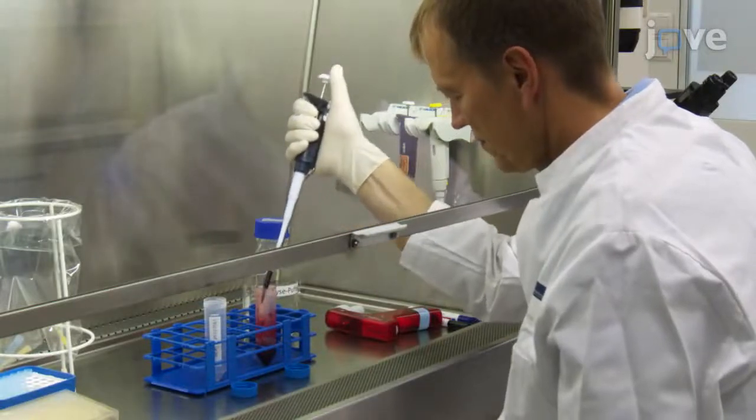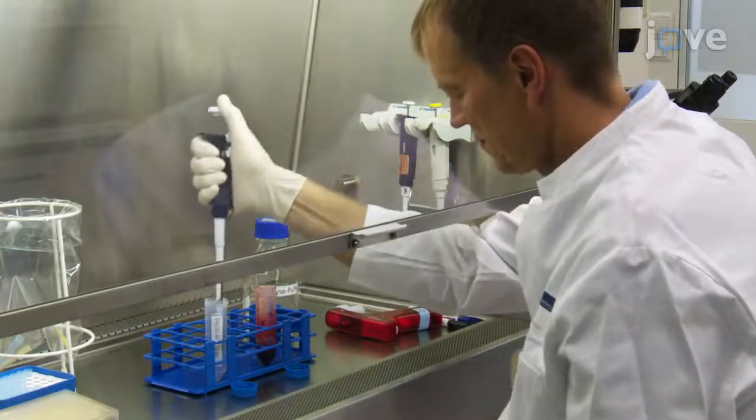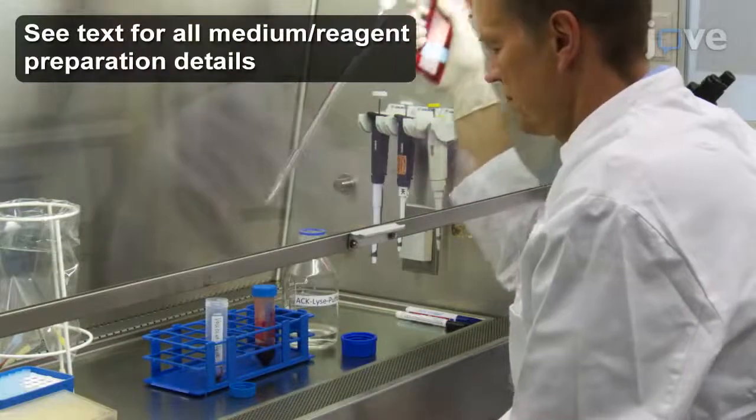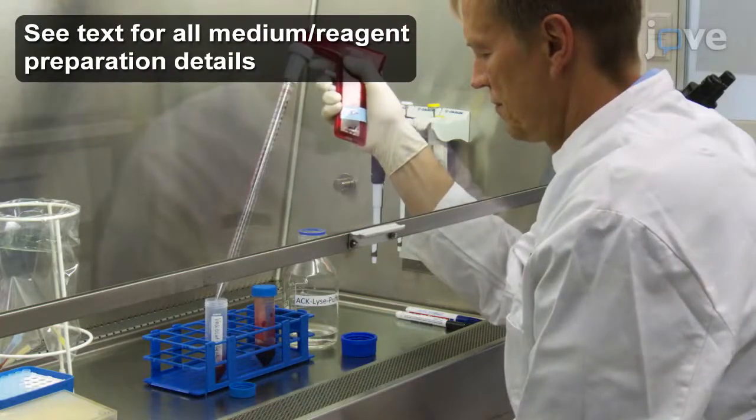Begin by mixing 1 milliliter of freshly drawn human peripheral blood with 30 milliliters of ACK lysis buffer in a 50 milliliter conical tube.